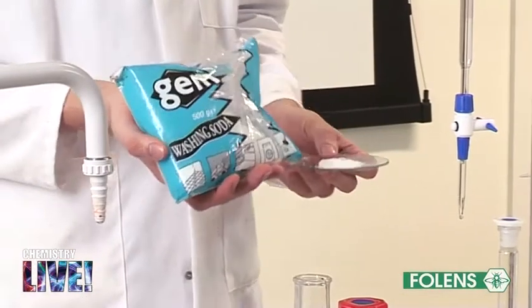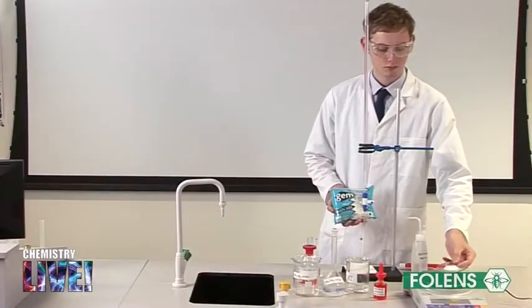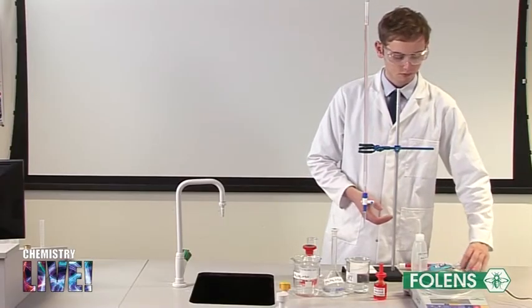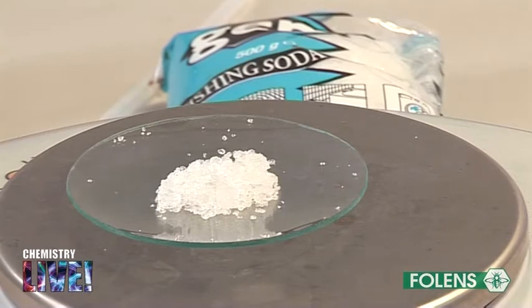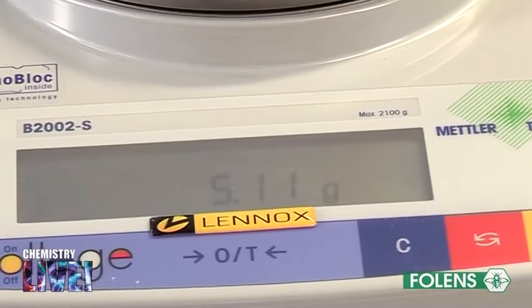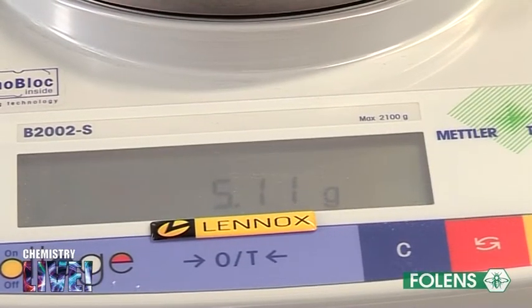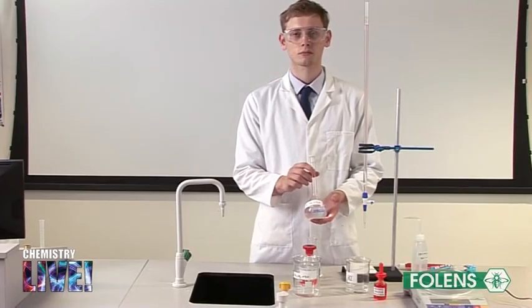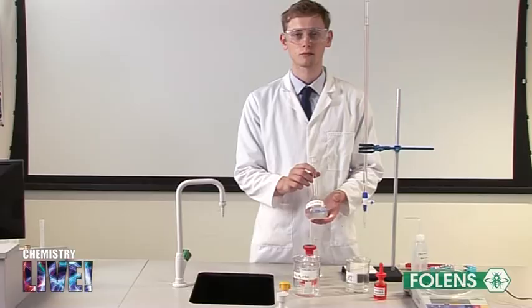About 5 grams of washing soda has been weighed out on a clock glass. Taking all the precautions outlined in the earlier experiment, the crystals were dissolved in about 100 centimeters cubed of deionized water.